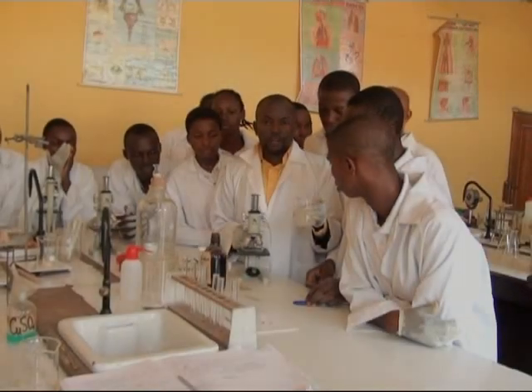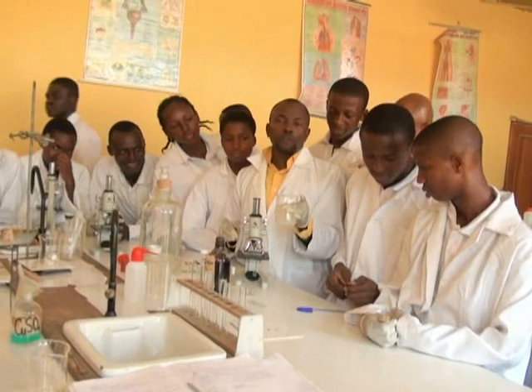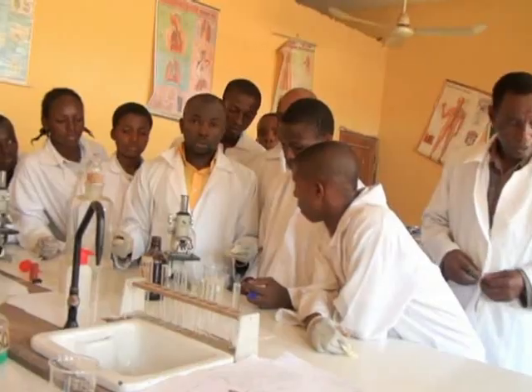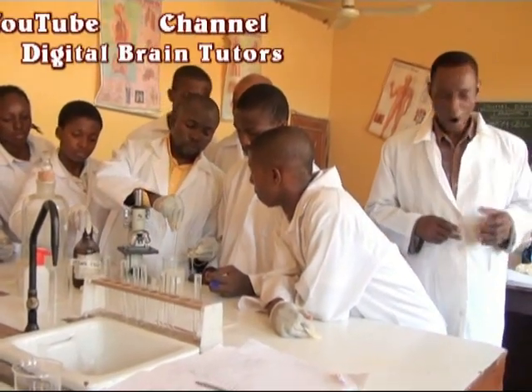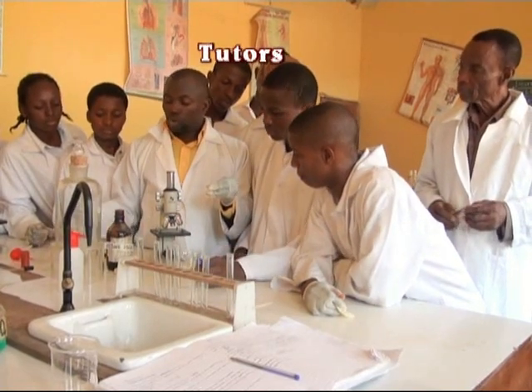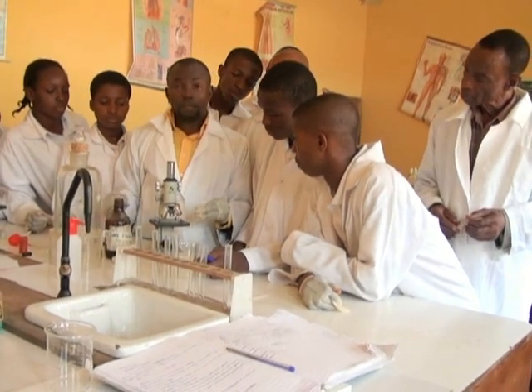You have examined others. This is freshly obtained palm wine. And we know that yeast is a fungus which causes fermentation of sugar. It lives in sugar solutions like palm wine. By means of the dropper, we collect few drops of the palm wine, introduce it on the slide, use tweezer, collect slip, cover it, and examine under the microscope.